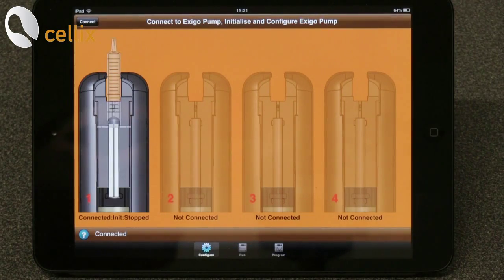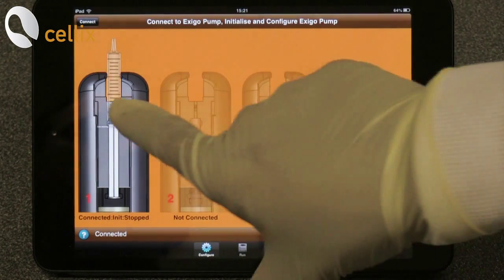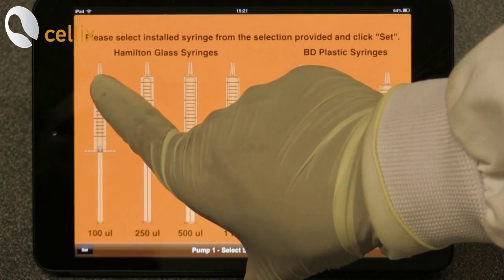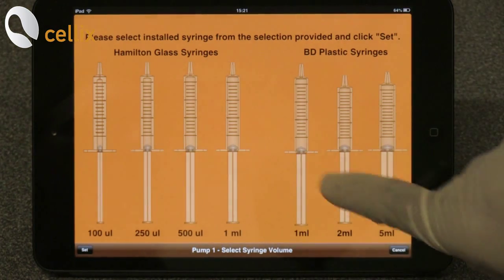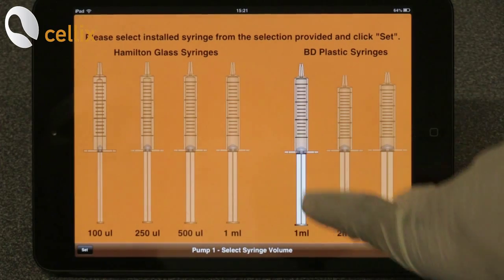Next is to select the syringe. For that, you double click the syringe. You have options for the glass syringe and the plastic syringe. You click the 1ml plastic syringe.